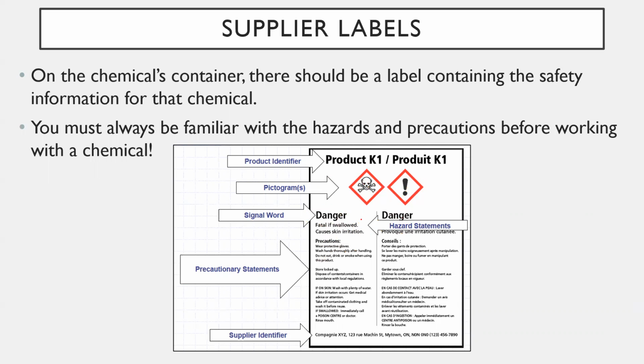So just breaking this down further, the skull and crossbones part of this comes into swallowing this chemical. The less serious health effects, that's the exclamation mark, would come into the skin irritation. So like I said, even though it seems like it contradicts itself where it's serious and not serious, it's serious in one way, not as serious in another way. That's where that's coming from there.